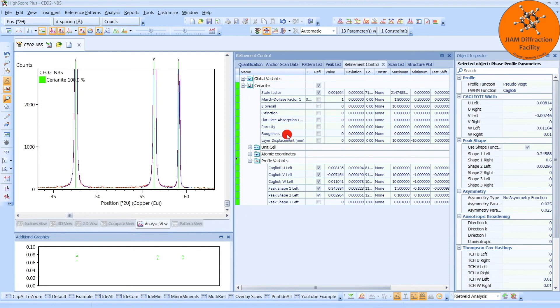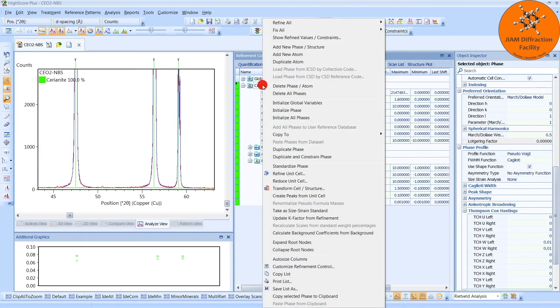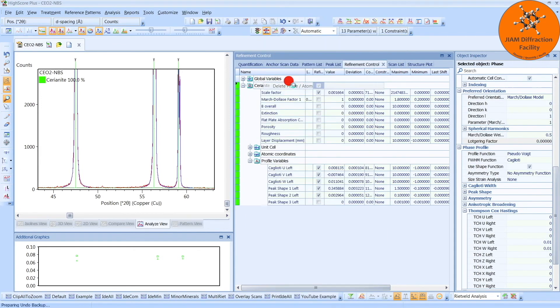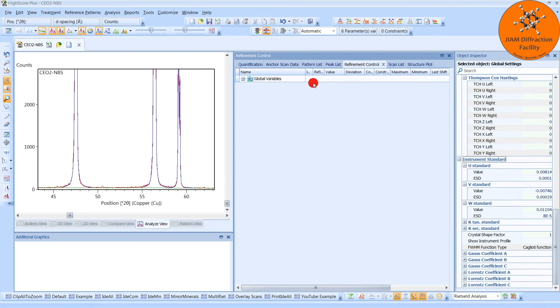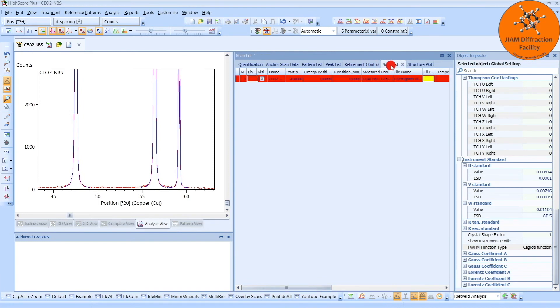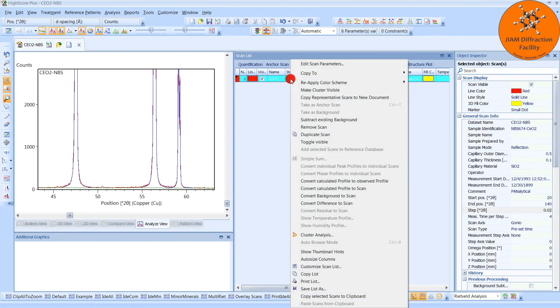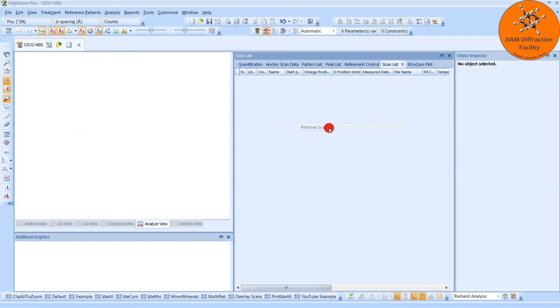So once we have that saved, we can right-click on the phase and then delete it. We can then go to the scan list, right-click the scan, and remove it. And now we have an empty file that has our instrument standard saved in it.